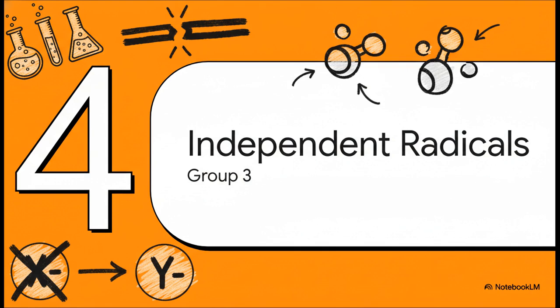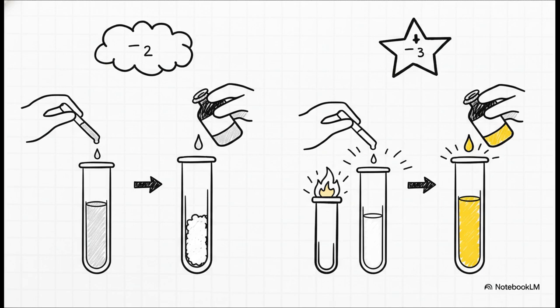These anions, like sulfate and phosphate, are pretty stable, and they just won't react with other acids. They need their own highly specific tests. So to nail these guys down, we need specific reagents. For sulfate, we use barium chloride. It forms this thick white precipitate of barium sulfate, which is famously insoluble. It won't even dissolve in strong acids.